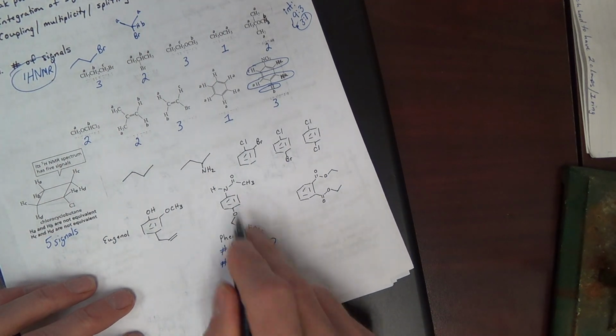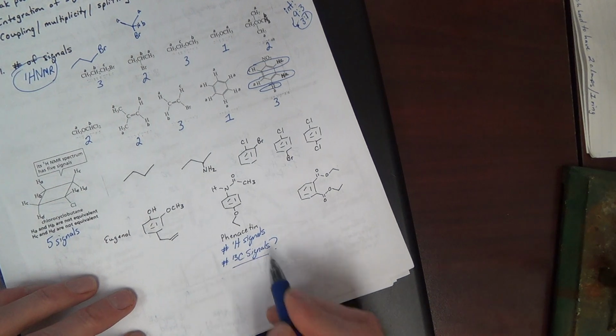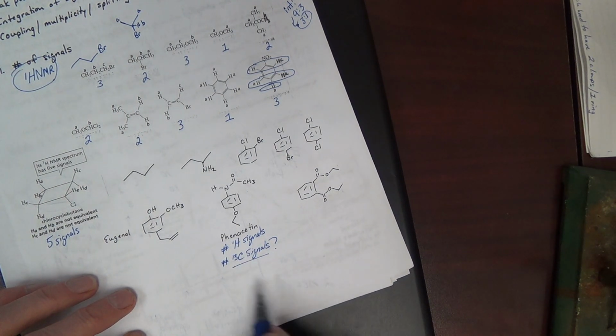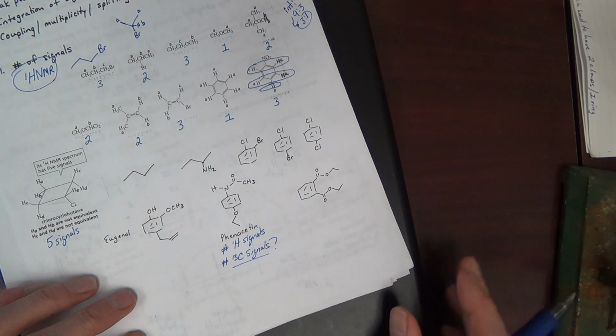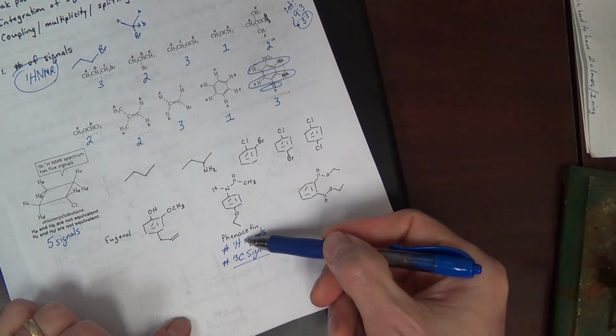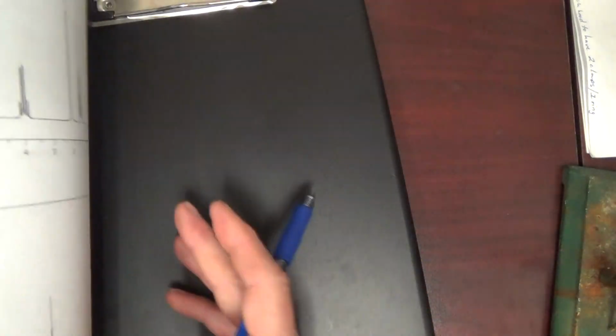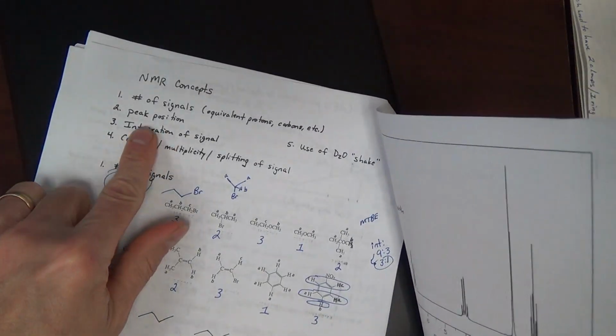If you have any questions, you can ask, but we will cover that, so think about that ahead of time. Otherwise, we will not be covering carbon until later in the handout. But then I give you the H NMR and the carbon NMR of phenacetine on the next page. But don't look at it. Don't cheat. Okay, well, let's move on to peak position.